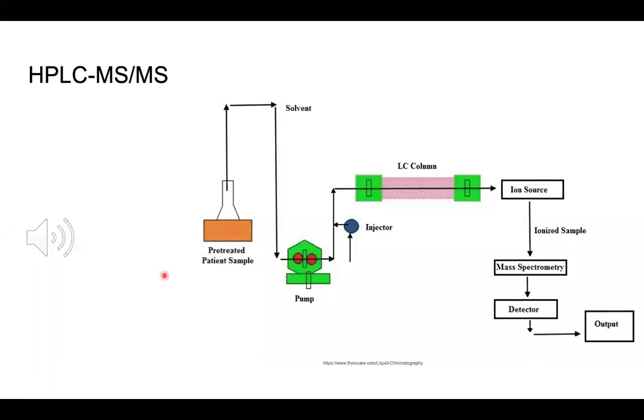So why is HPLC with tandem mass spec the most appropriate chromatography technique for the separation? Historically, two separation methods, namely gas chromatography and HPLC, as mentioned, have been mainly used for most research dealing with the analysis of cannabinoids.